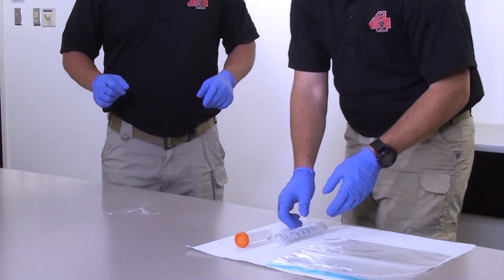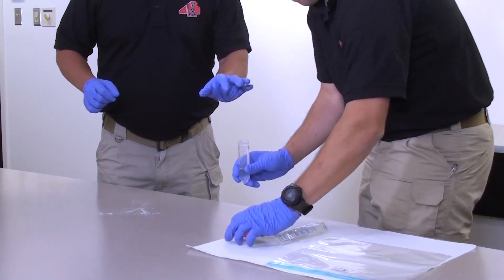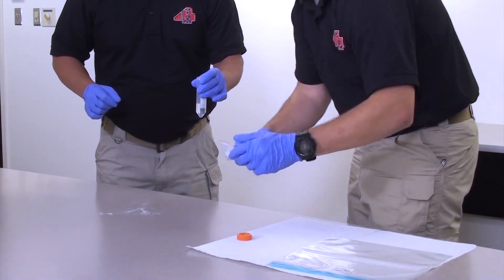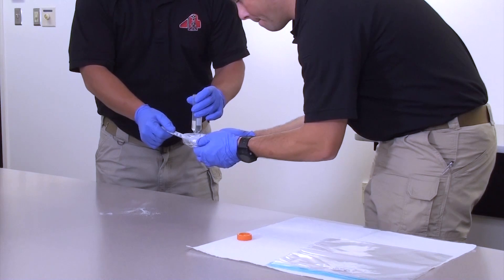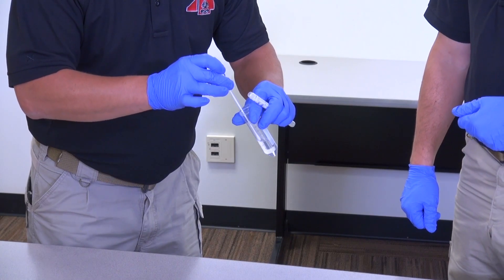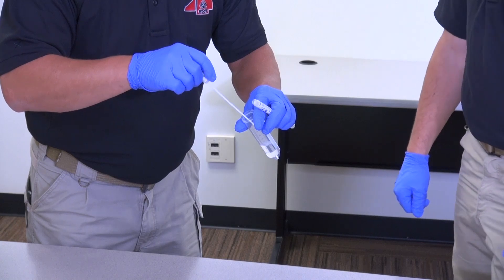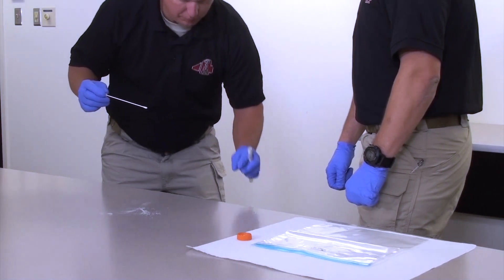Method B procedure. After method A is complete, the facilitator removes the lid from the vial labeled as buffer and hands the vial to the sampler. The facilitator loosens the swab from the tube but does not remove the swab, and then presents the tube to the sampler. The sampler holds the tube and buffer vial in the same hand. The sampler removes the swab from the tube and places it into the buffer vial to moisten the swab, using aseptic technique to prevent cross-contamination. The sampler places the swab against the side of the vial to remove excessive liquid, then removes the swab from the vial and drops the vial into the biohazard waste container.